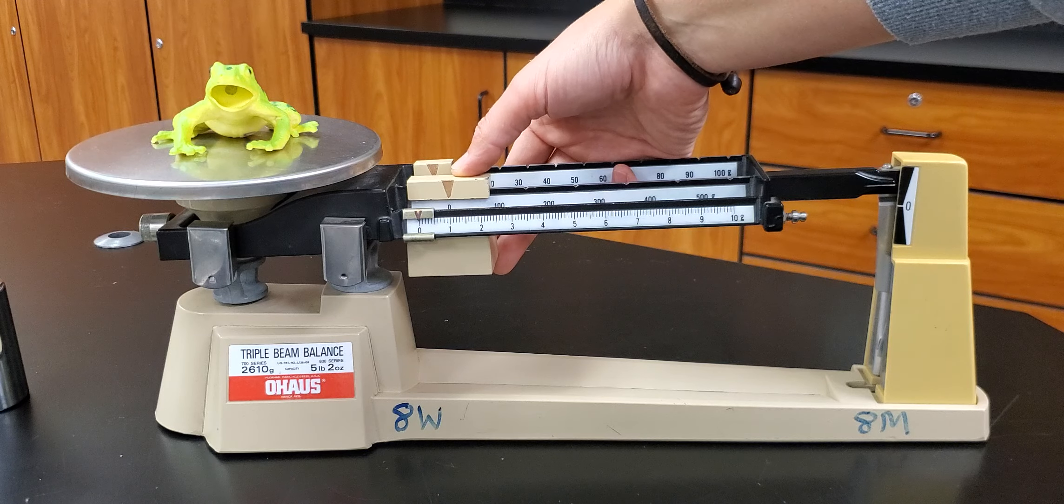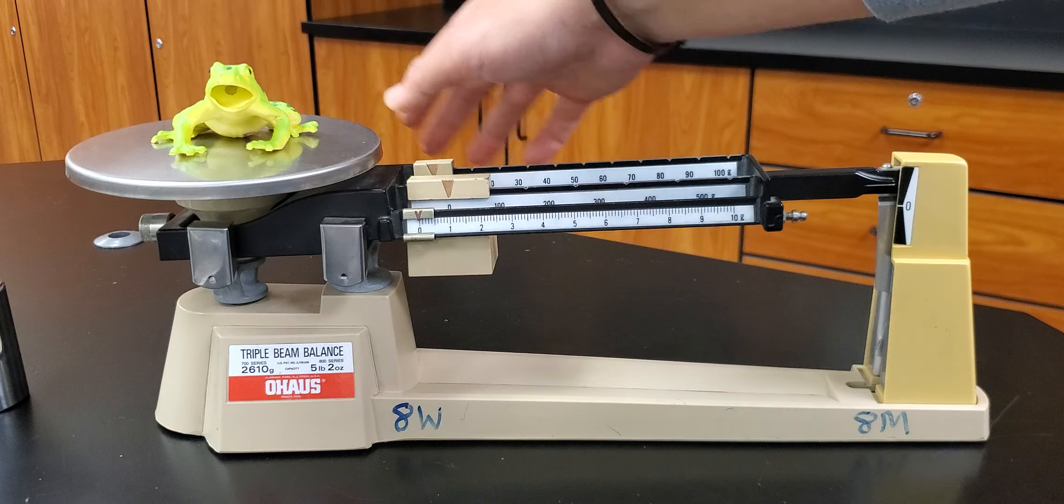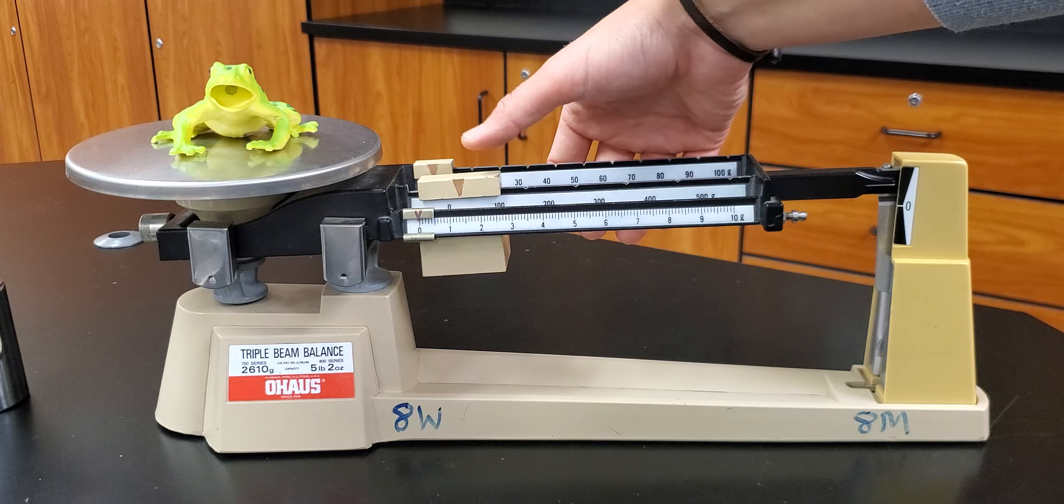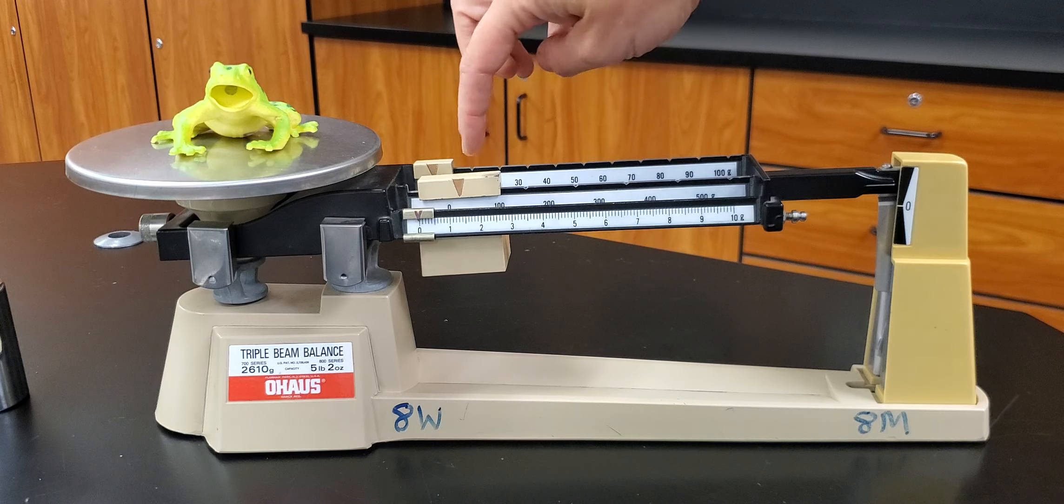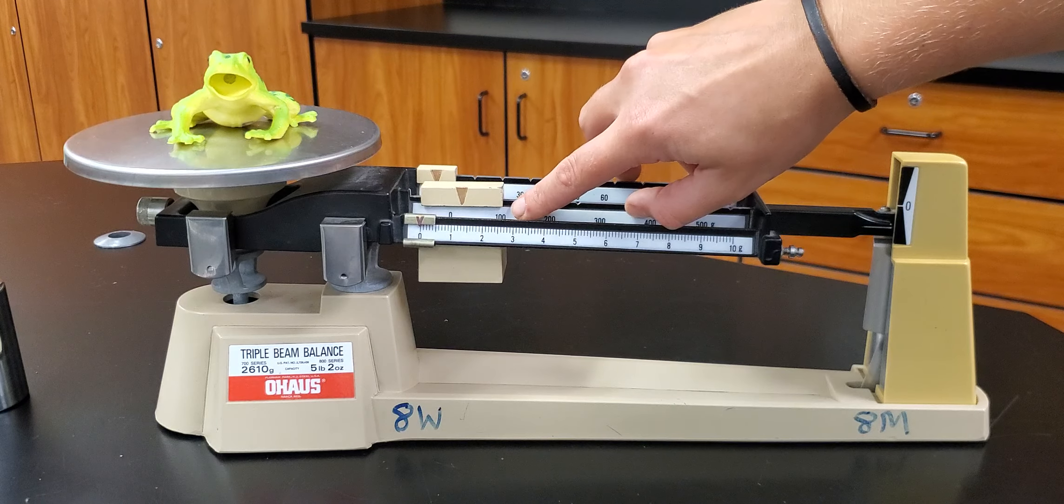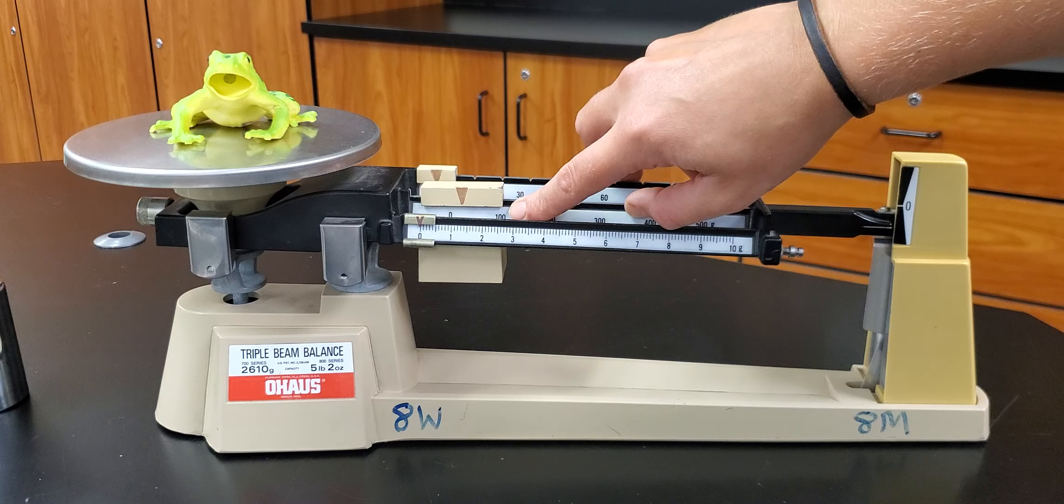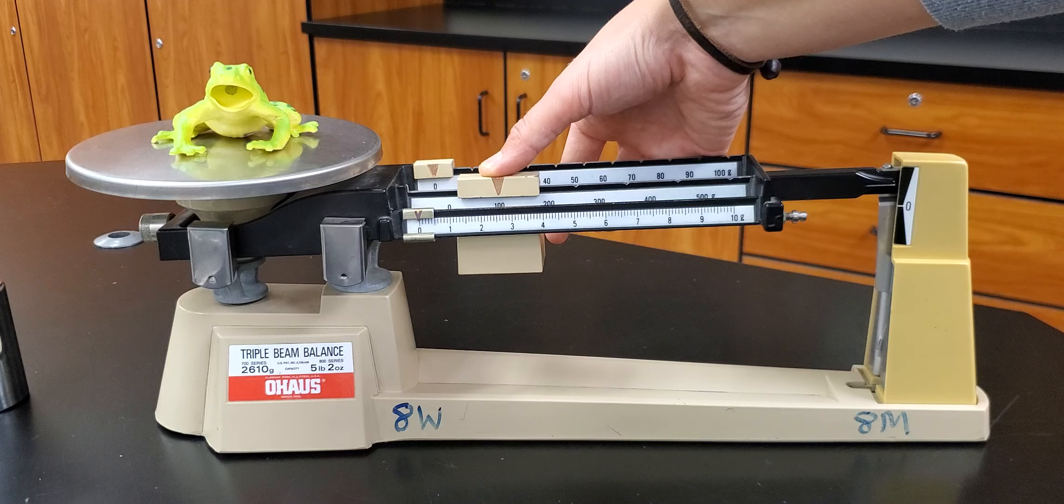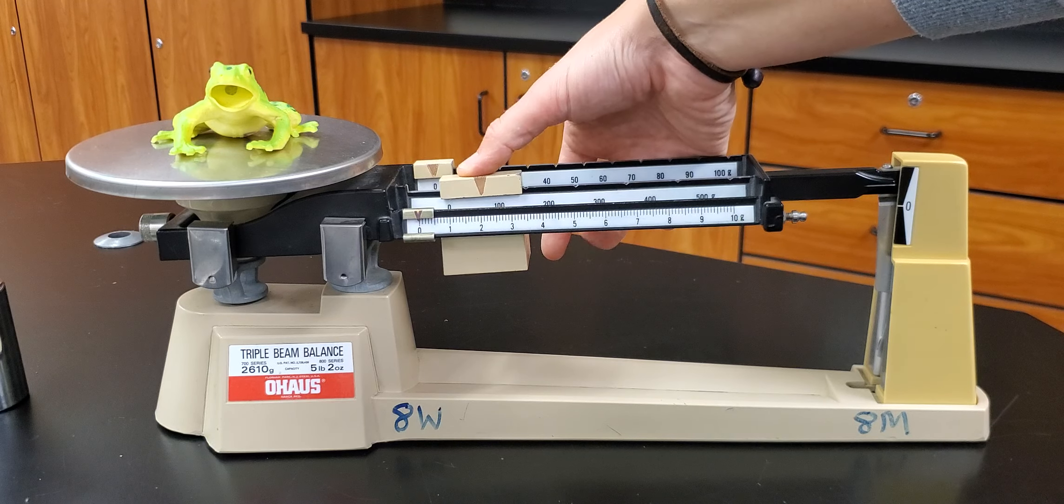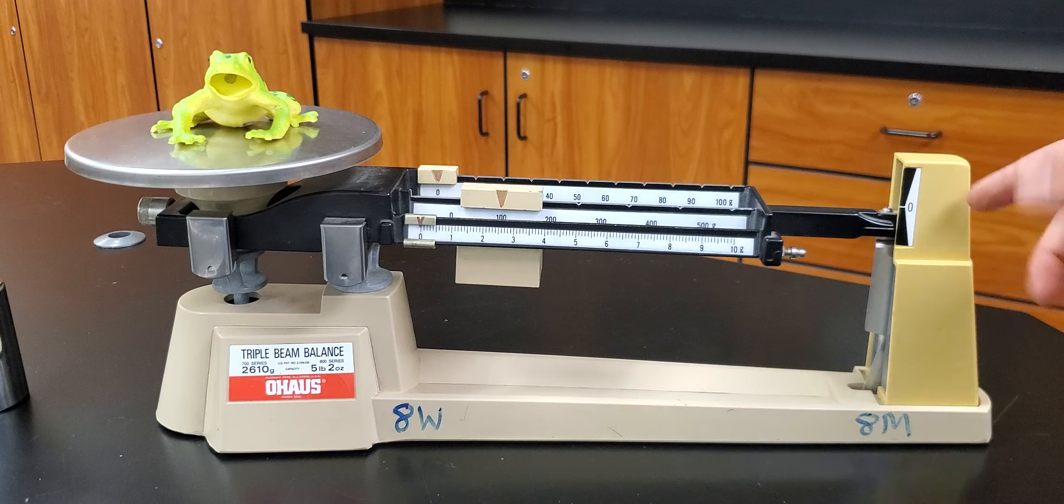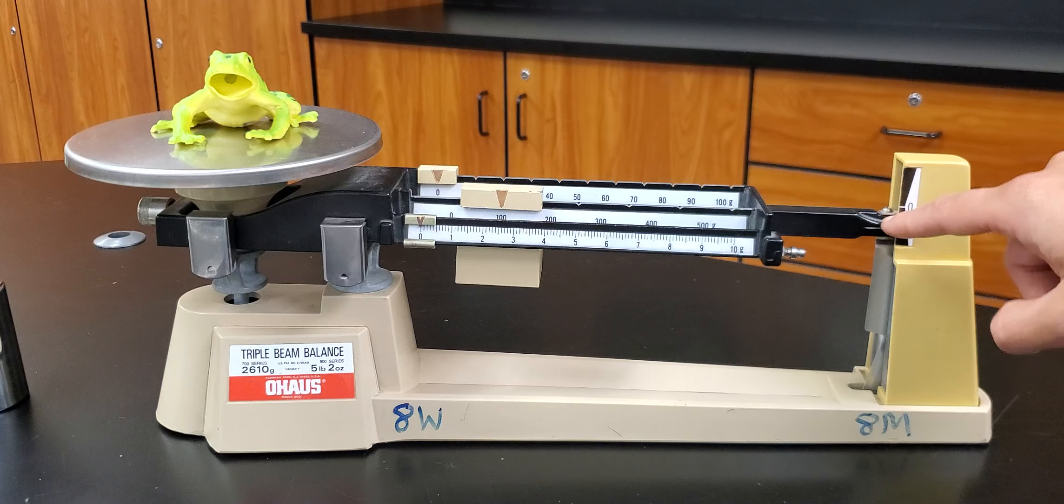So we always start with the biggest weight whenever we're measuring something. So I'm gonna start with this hundreds place weight and I'm gonna slide it down the beam until it clicks into the proper groove and this arrow will be pointing then at the 100 measurement right there. Okay? So I'm gonna slide it and listen for that click. Did you hear that click? I'll do it one more time a little bit louder. There we go.